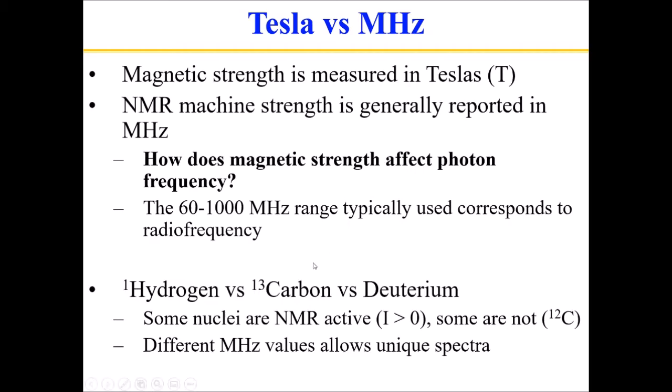You can conduct NMR spectroscopy on a variety of different atoms. They have to have a particular magnetic field with their nucleus. And the ones that we're going to focus on primarily in organic chemistry are the protons found in hydrogen, or carbon-13 atoms found in carbon. Deuterium actually doesn't show up in the NMR experiments that we run.